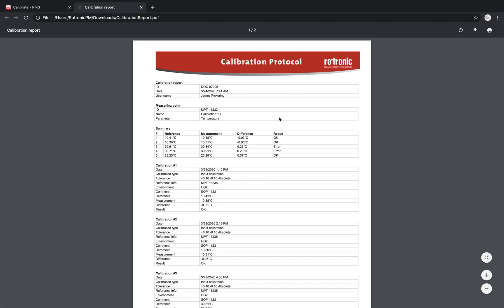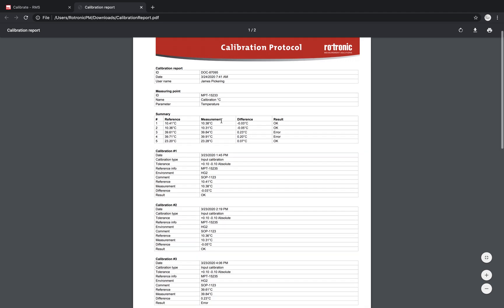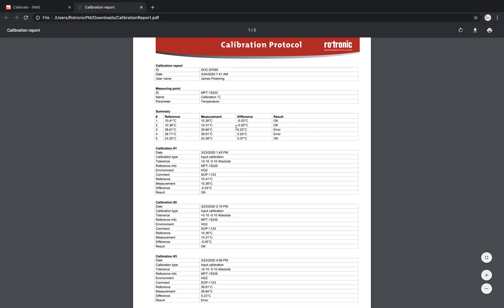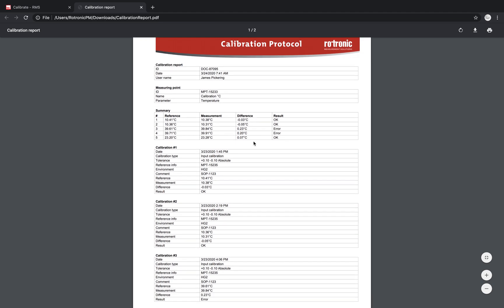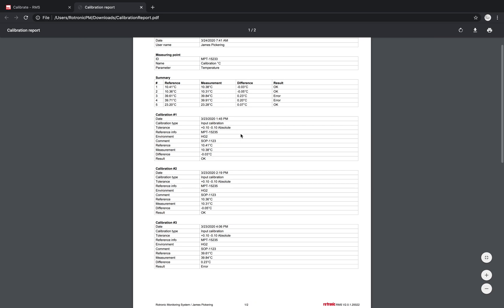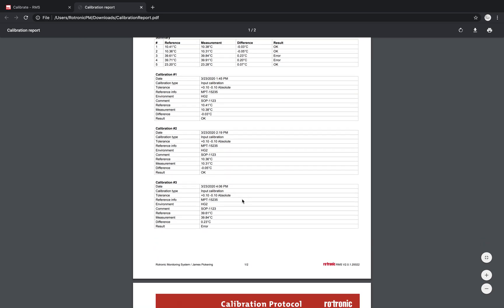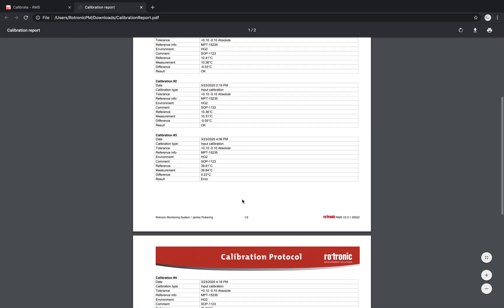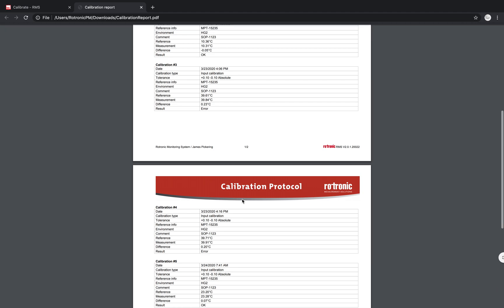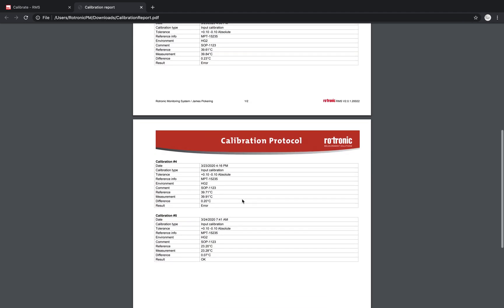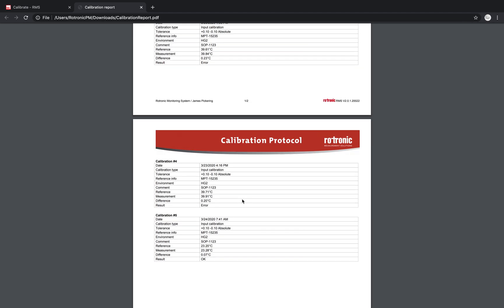I'll check out this PDF. Then I can see on this calibration protocol exactly what happened. So it's a document that's saved in the system with a unique ID. We've got a date. We've got the username. We have the measuring point information. And we have the summary here of all of the calibrations that we carried out. And then we have more detail about each and every calibration below with all of the information that was added into the system.